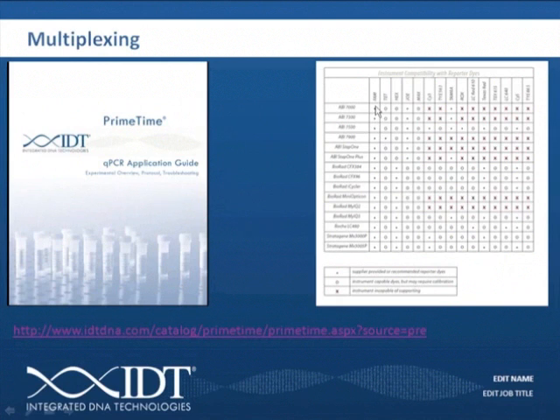So I always have FAM. FAM is a very reliable dye, and then spectrally I try and see what is calibrated on the instrument. Suppose it's BioRad, you can do a FAM and HEX. If you want even more than that, then you would go across this chart and see, okay, it's calibrated for this instrument. I can use FAM, HEX, and Texas Red. So this definitely helps in terms of identifying what dyes to use for multiplexing.